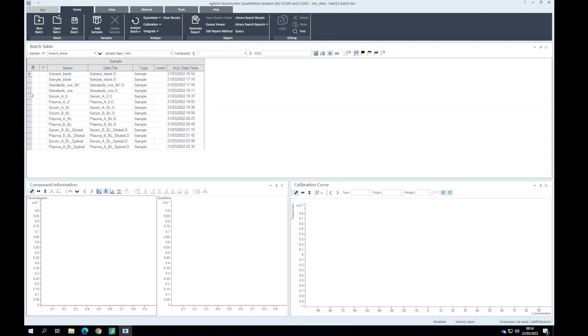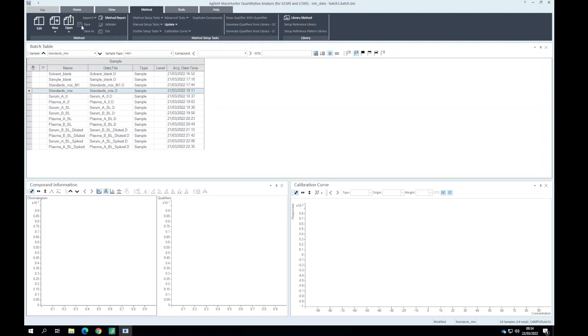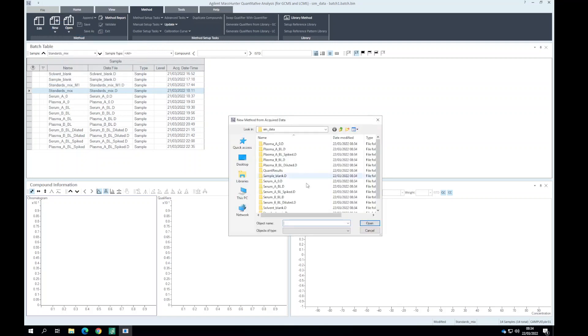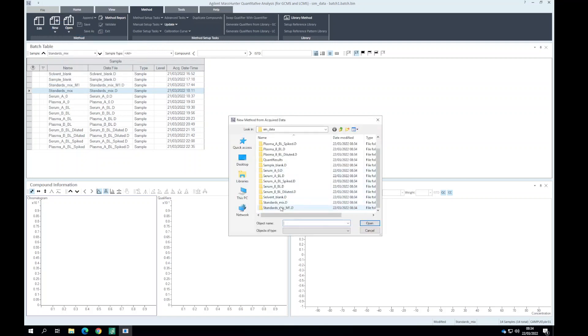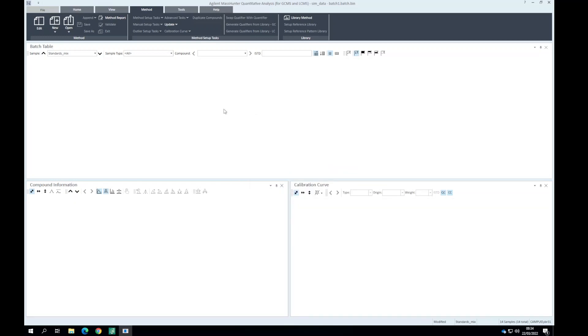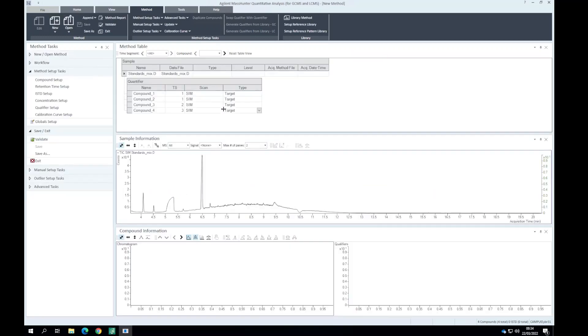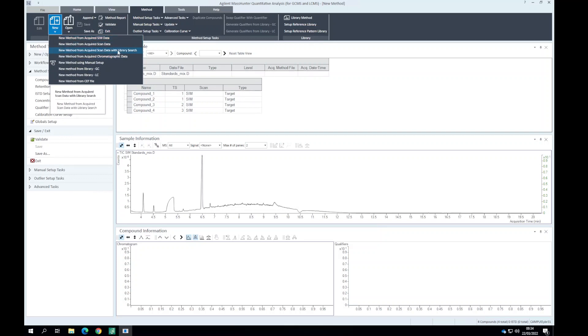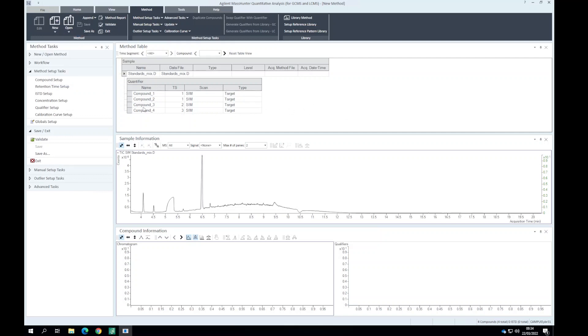From here on I'm going to use one of the standards and I'm going to create a new method from simdata. This might take a while, but it's easy enough. It's incorporated all the simdata method. I set new method from acquired simdata. We could do it manually but there are other options of importing compound information.